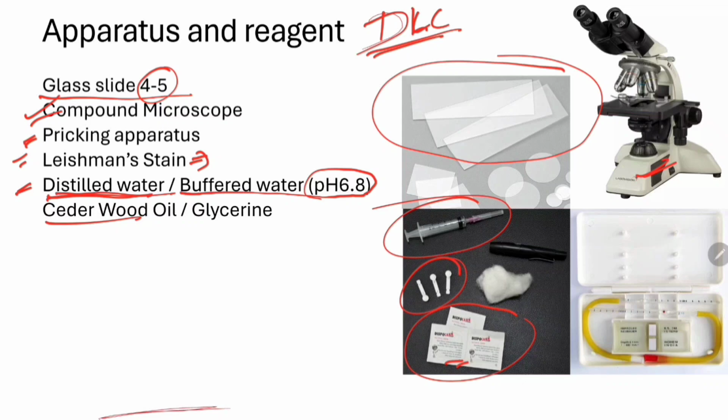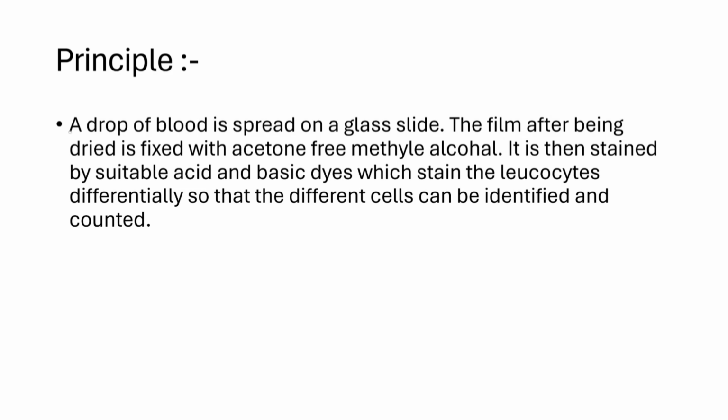Cedarwood oil we usually use. If cedarwood oil is not there, then we can use glycerin, or we can use liquid paraffin. The liquid paraffin, cedarwood oil, or glycerin have a refractive index similar to that of the glass slide. So think about the principle.